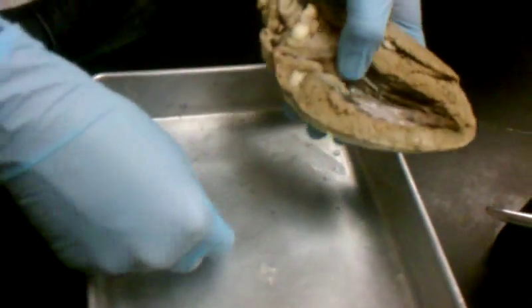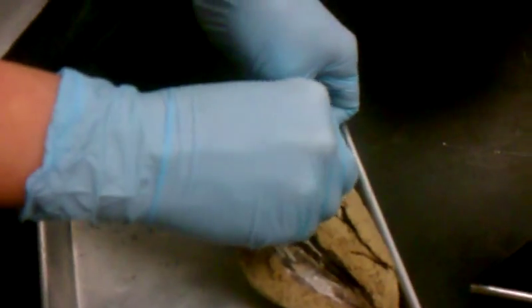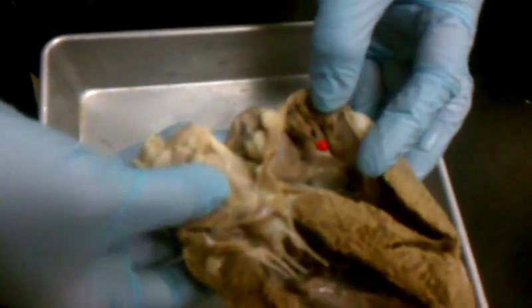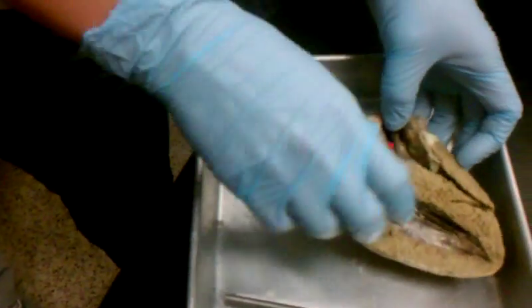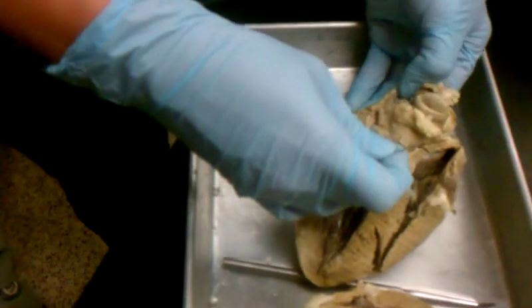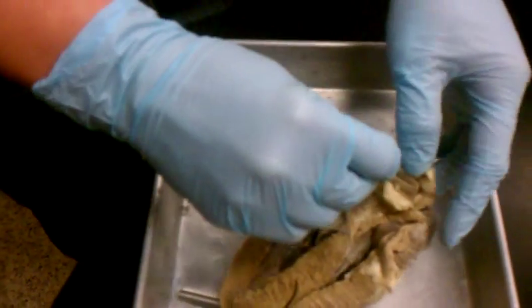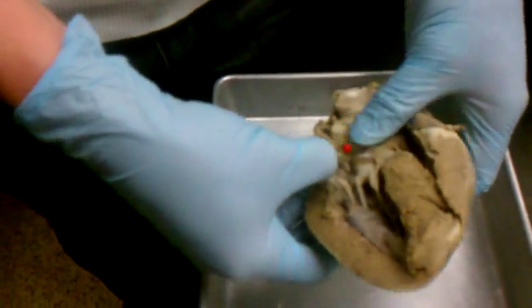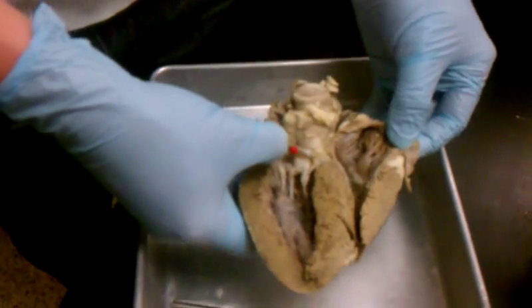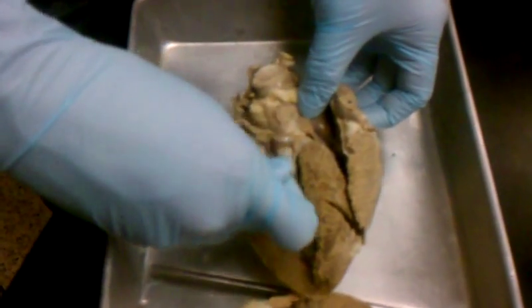Okay, and then pectinate is the ones inside of the atrium. So if I were to pull an atrium apart, and I pin that, and ask you what muscle that was, that's pectinate muscle. And that's only on the right side? It's on both sides. But most of the hearts don't actually have this intact, so I never really seen one that nice. So chances are in there, and I ask you what muscle that is, that would be pectinate. It's hard to see, and I would probably do it more on one that I can actually pull open and show y'all. And where would you pin for like the atrium again?